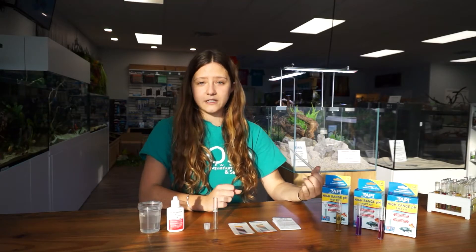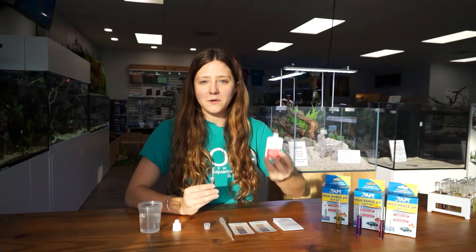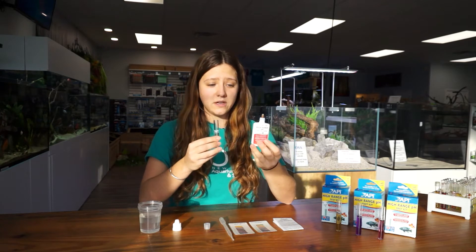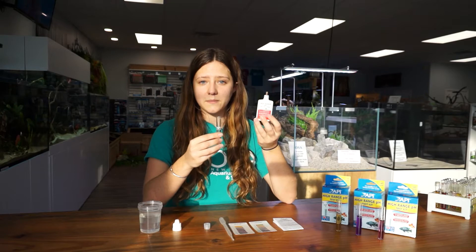All right, let's get started. First, you're going to fill your test tube up to the line with water. After you fill your vial up, you're going to add five drops from the bottle into your tube. You want to make sure that you hold your bottle completely upside down to ensure that you get the same size drops going into your vial.